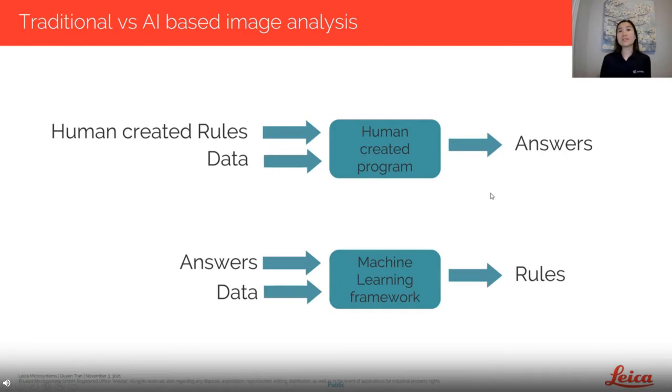And what it provides us are the rules that govern and characterize why the cell is unique, why it's different from the background, why it's different from the other cells or the other proteins that you could look for that are in your image, essentially. So it's a collection of rules that really help us characterize the unique objects that we're trying to detect.